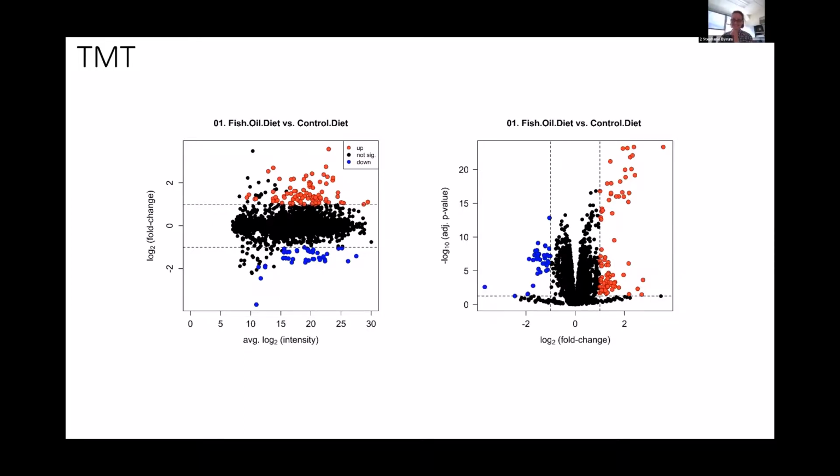So the question is, is Cyclic Loess the most popular normalization method? How do we know which one is the best when you're trying to decide from 10 different methods? Yeah, so Cyclic Loess is kind of my default. If they all look the exact same, I default to Cyclic Loess. It's part of the limma package, and we're running the limma algorithm. So yeah, it's always a good question. I don't know that I have detailed specific answers, but that's what I do. I kind of default to Cyclic Loess.